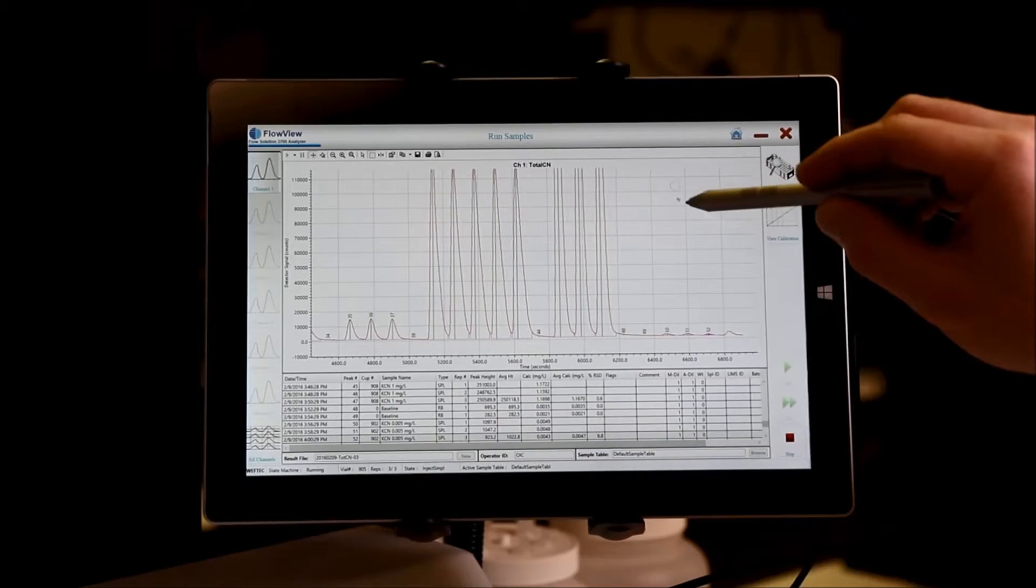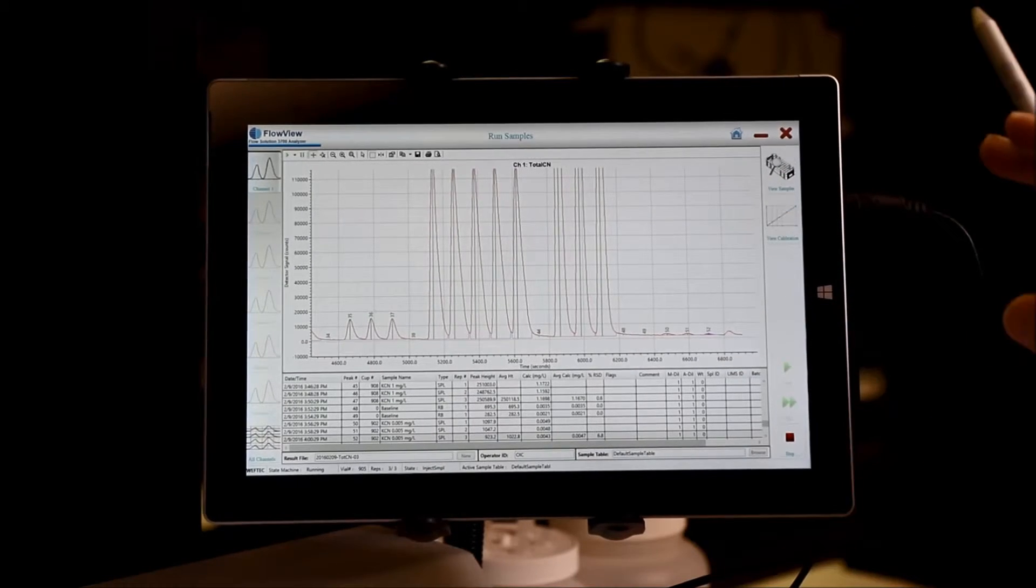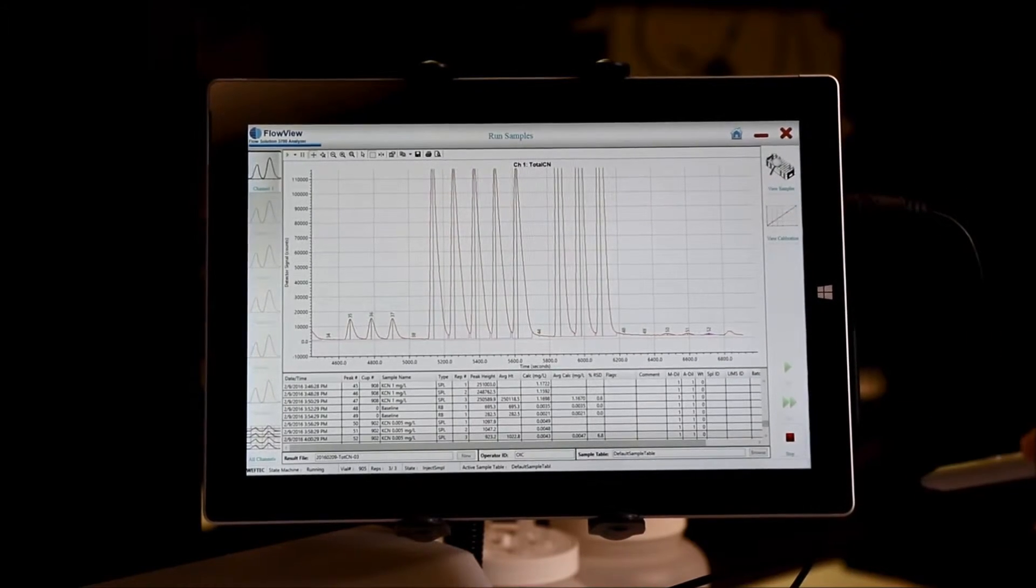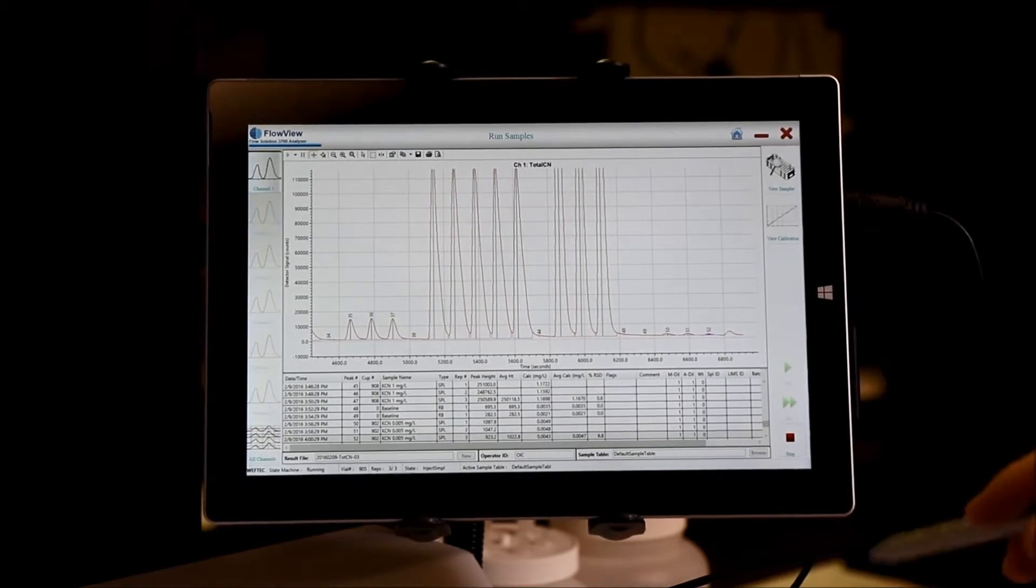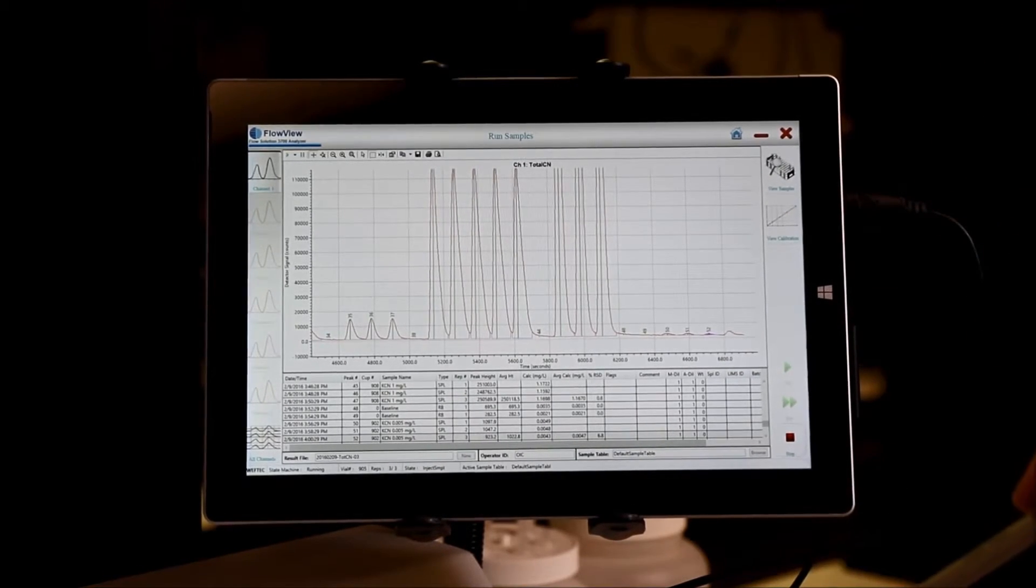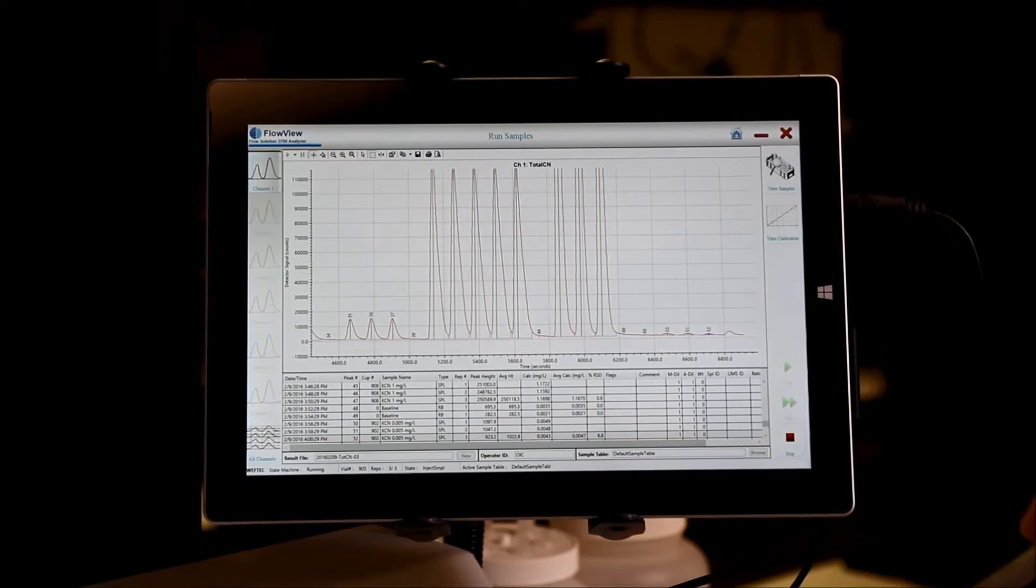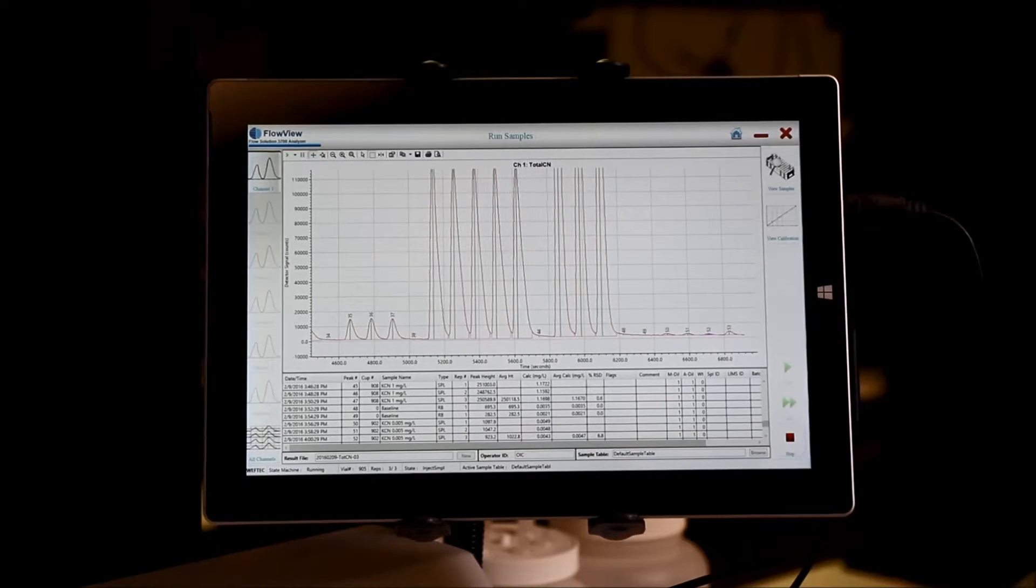Once changes are made, everything automatically saves, and your run continues until the sample table is completed.